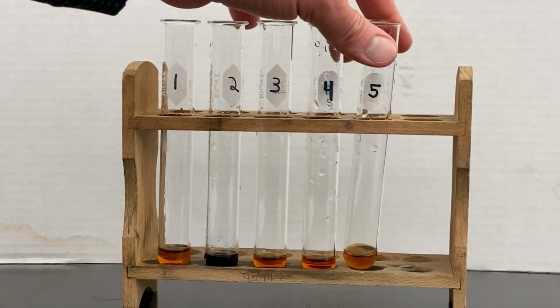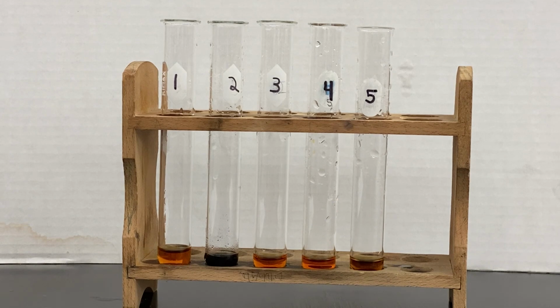So that's something that you're going to have to figure out. That was the powdered sugar. Maybe you should Google the ingredients of powdered sugar, and that might give you some insight as to why we're getting maybe a subtle change. Definitely something going on in there.